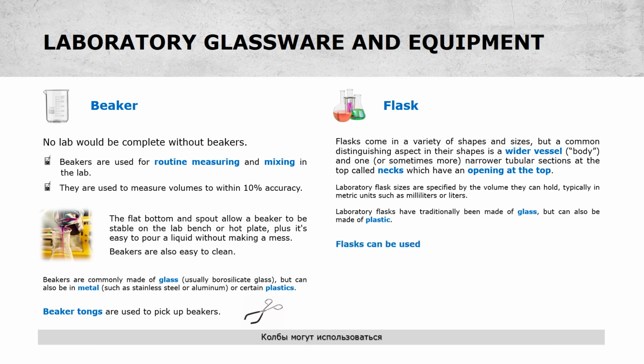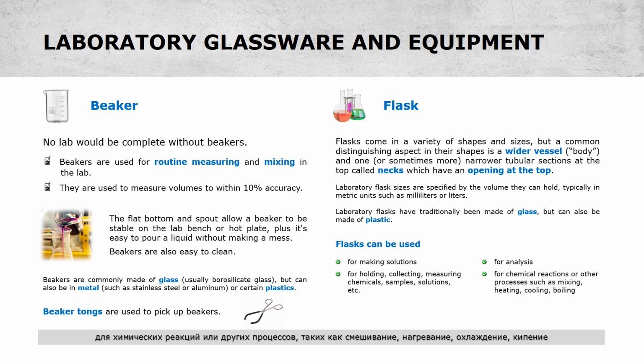Flasks can be used for making solutions, for holding, collecting, measuring chemicals, samples, solutions, etc. For analysis, for chemical reactions or other processes such as mixing, heating, cooling, boiling. There are several types of laboratory flasks, which have different functions within the laboratory.